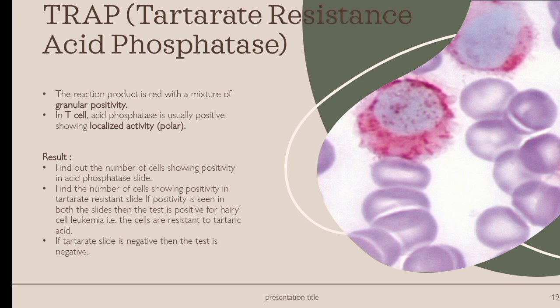If the positivity is seen in both slides, then the test is positive for hairy cell leukemia, because the cells are resistant to tartaric acid. And if the tartrate slide is negative, then the test is negative.